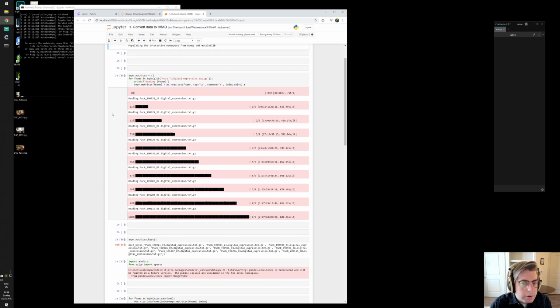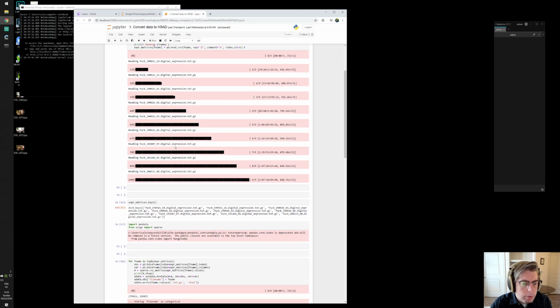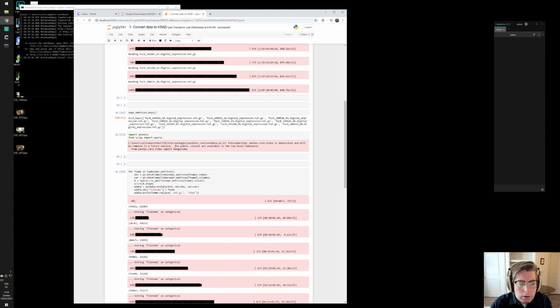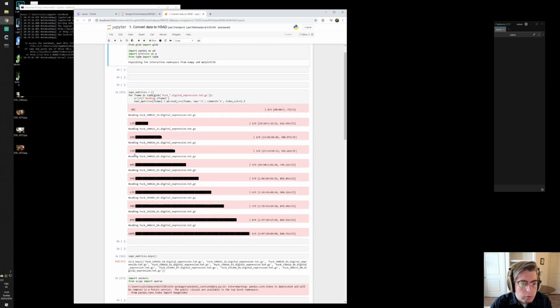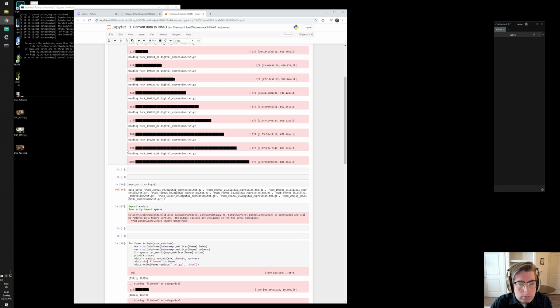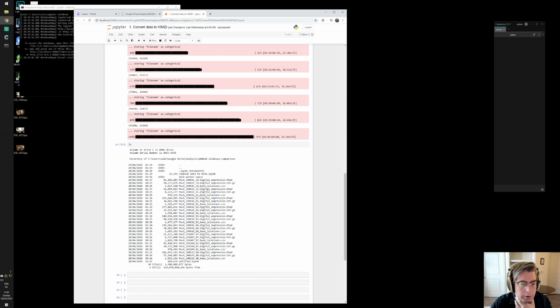So the last time I did this, I had to redo the reading of the files and converting them to H5ADs because I made a mistake in which file I was reading. Since then, overnight I converted all of the txt.gz files to H5AD files.